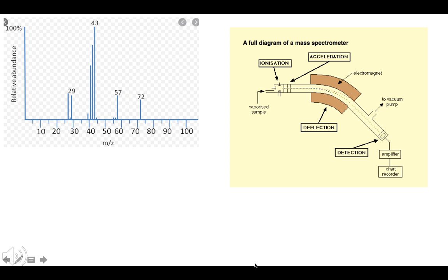Alright, so I'm going to attempt to explain how a mass spec works. Mass spectrometers are devices used to make a very precise measurement of the mass of a particle. It does this by using electric and magnetic forces, in 4 parts. The first part is ionization. They'll either make the particle gain or lose an electron so it becomes charged, so it can undergo an electric force. Let's say they took away an electron, so it became positively charged.